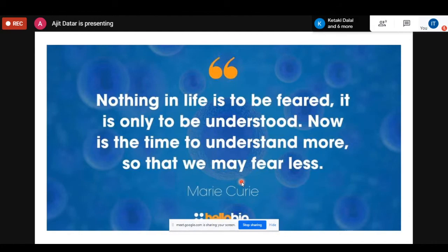It doesn't happen in mass spectrometry, definitely. If it happens in the ionization source, also it is not possible. So any kind of such interactions are very rare in mass spectrometry. I do not know where she's talking about such kind of reactions.